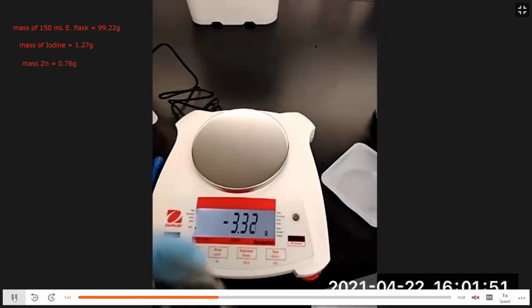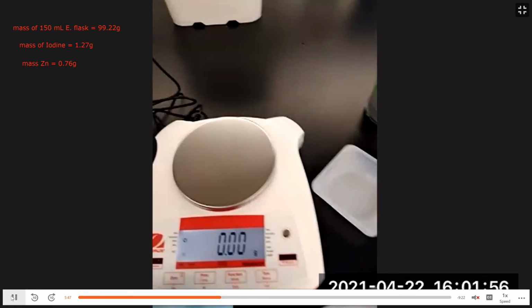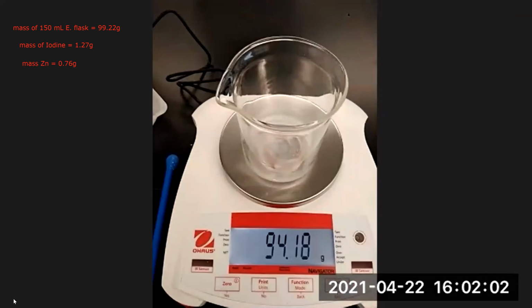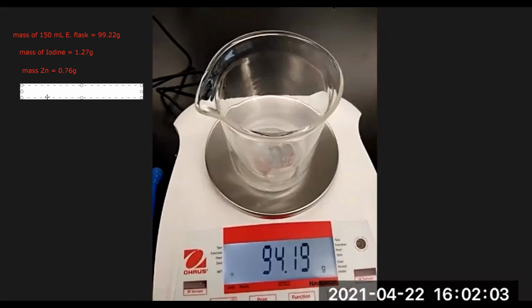So what we need to do is pre-weigh the beaker. We're going to get the mass of the beaker. The mass of the beaker is 94.19 grams. And you're seeing us take the mass of the Erlenmeyer flask and the beaker because it's going to help us when we're recording the mass of unreacted zinc and the mass of product.